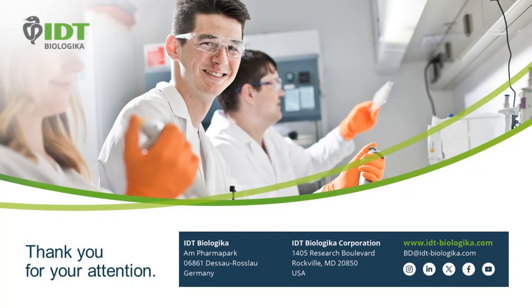And when we speak about fast-track analysis, we are also able to use these technologies or methods to accelerate, at the end, the release of our products. For example, for mycoplasma or mycobacteria or adventitious viruses testing, which can be accelerated down to 1 week using these next-gen technologies or FTA analysis in combination.